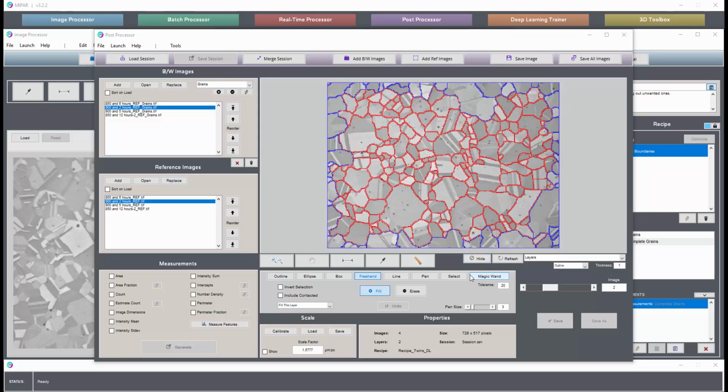Of course, the engine is only going to learn what you provide it. So we recommend that you show it extremes if you have very different microstructural cases, different lighting conditions, prep conditions. Make sure that it is aware of the potential variation it can see. Again, that can happen iteratively over time. So let's go back and take a look at the next application.